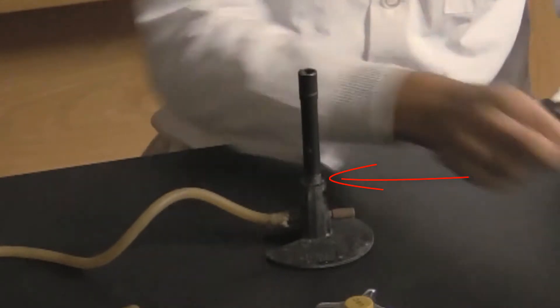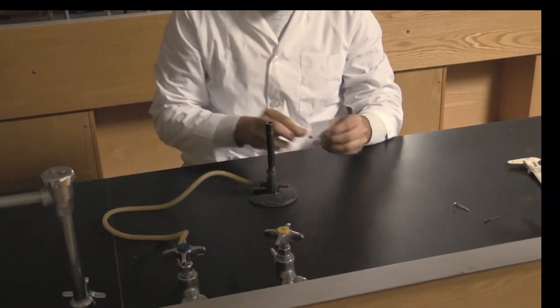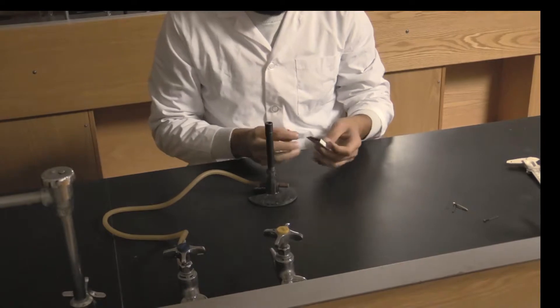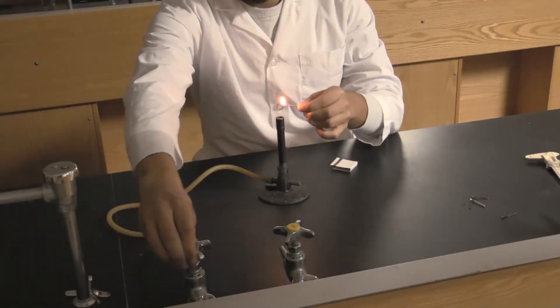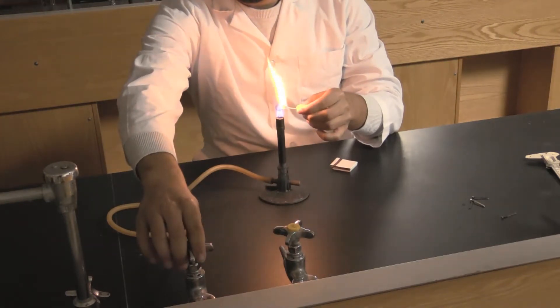Solem will light the burner with a match. Turning on the gas, he brings the match to the top of the barrel and lights the gas. He can now adjust the flame by changing the gas flow and barrel position.